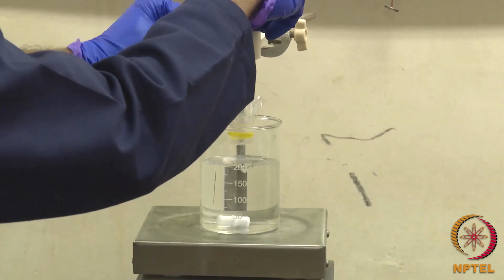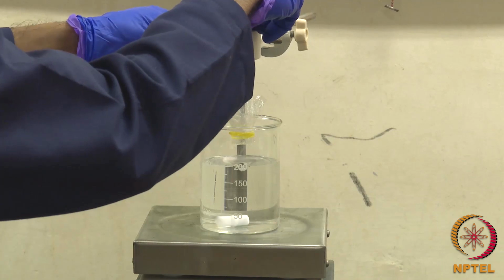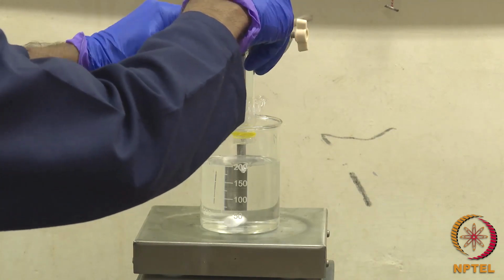The tube was placed in a beaker containing 200 milliliters of phosphate buffer with pH 7.4.